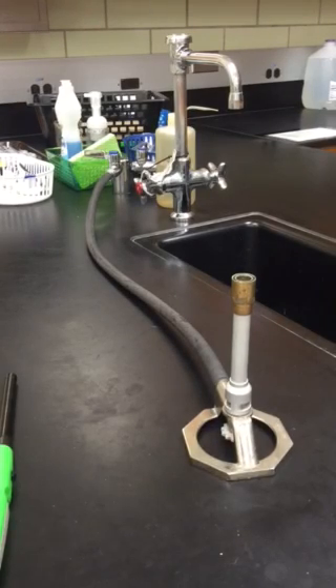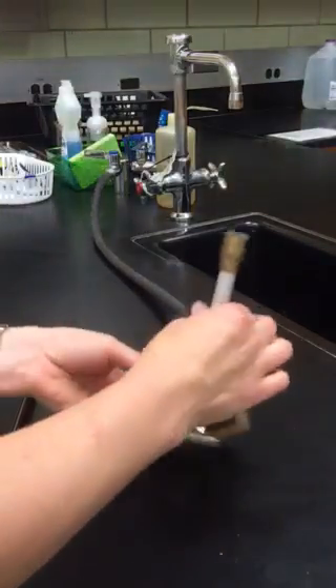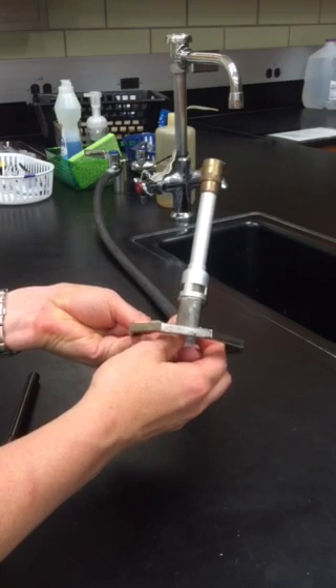Today I'm going to show you how to light your Tyrell Burner correctly for use in the lab. The first thing I want to point out is that I have both my barrel of my burner and the gas flow adjustment knob completely closed.